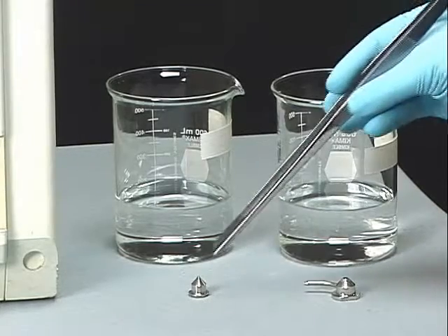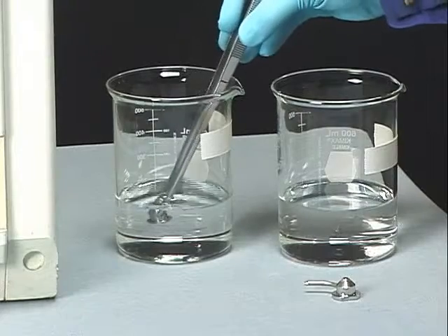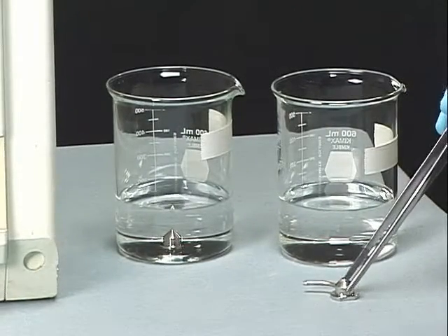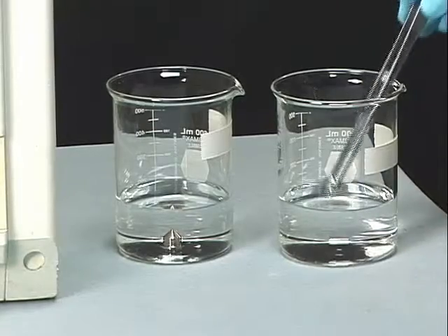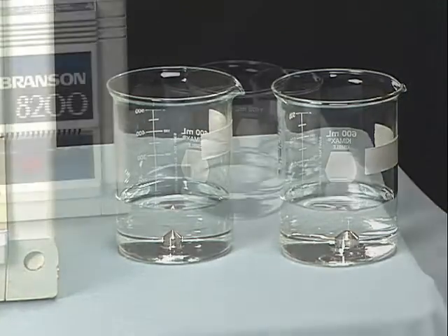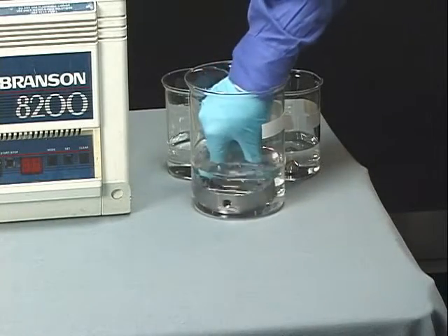Immerse the sample and gas cones in separate clean glass vessels containing 50-50 methanol and water. Ensure that neither cone is placed on its tip at any point during the cleaning procedure. Place the disassembled ion block in another vessel containing the same solution.